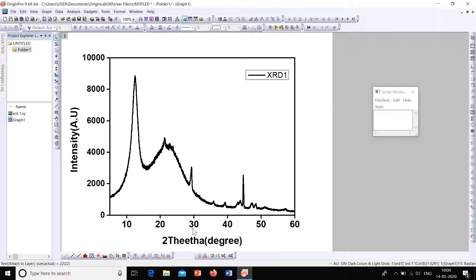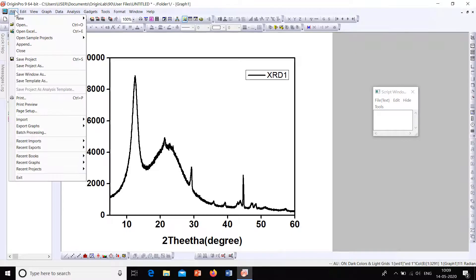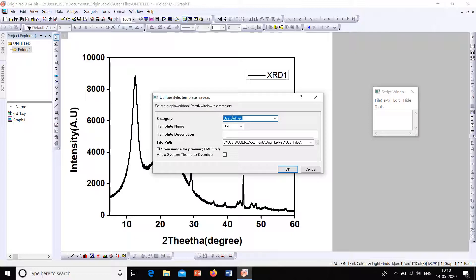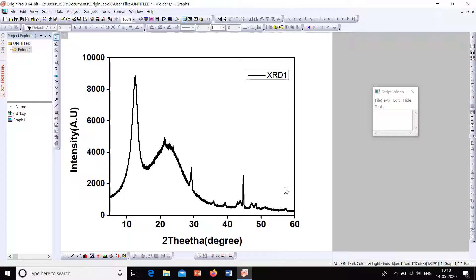Now I'll show you how to save this as a template. If you have other XRDs to plot later, you can directly select the values and use the template so that this axis formatting is always available to you. Go to File, then click 'Save Template As'. The category is 'User Defined'. Give the template a name — for example, 'XRD 1' — and click OK. The template 'XRD 1' has now been saved.